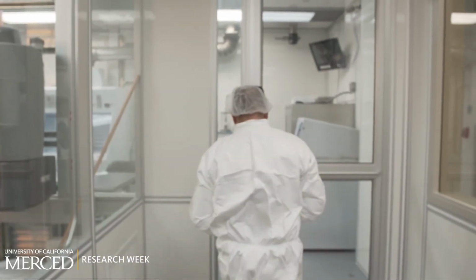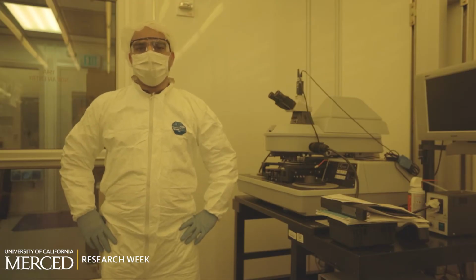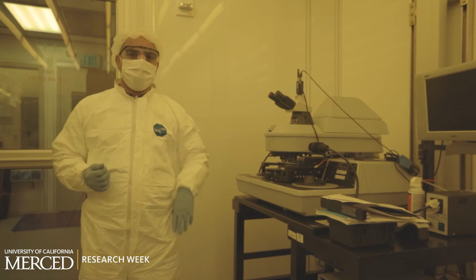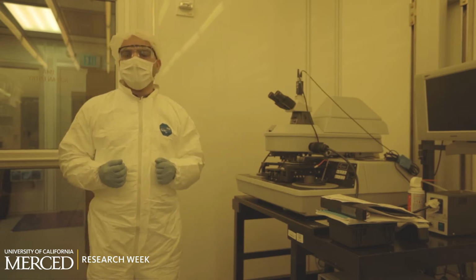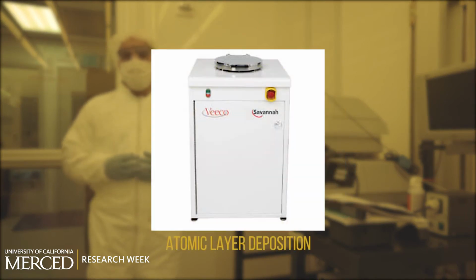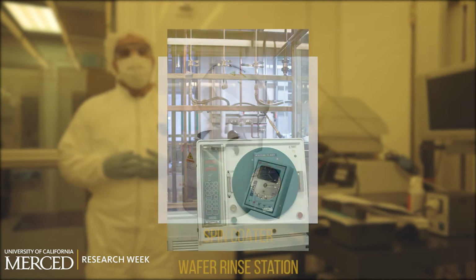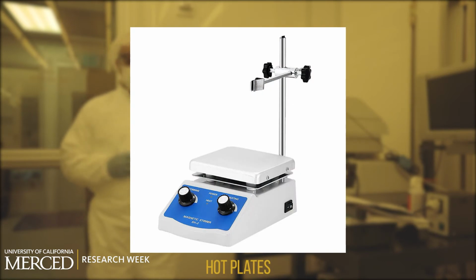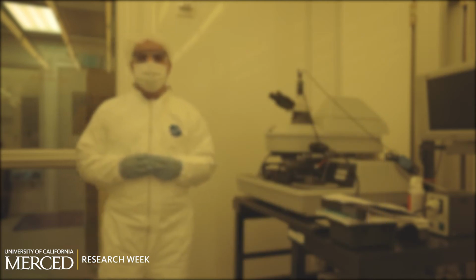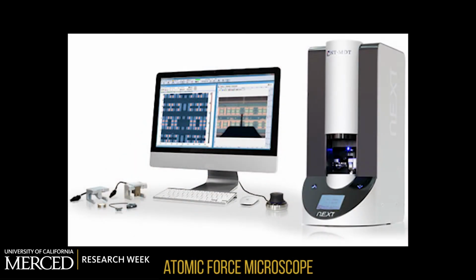Hi, I'm Praveen Kumar, Technical Director of Cleanroom. I'm going to show you the cleanroom area and provide you information about the cleanroom. In our facility, we have a mask aligner used for UV photolithography, focused ion beam, atomic layer deposition, electrospinning, sputtering, spin coater, wafer rinse station, hot plates, ovens, and dry and wet working stations inside the cleanroom. And we also have profilometer and atomic force microscope outside the cleanroom.